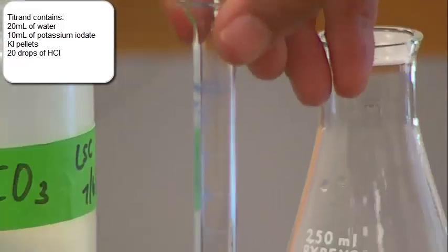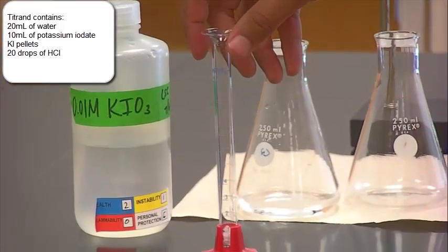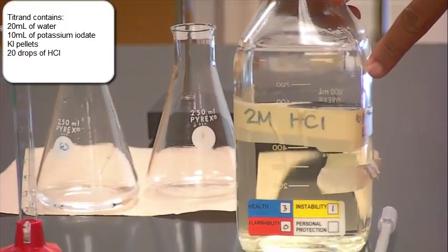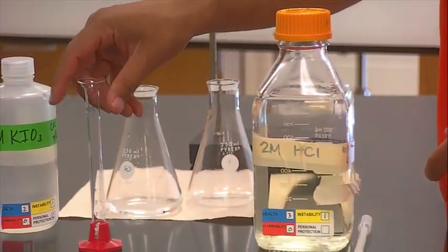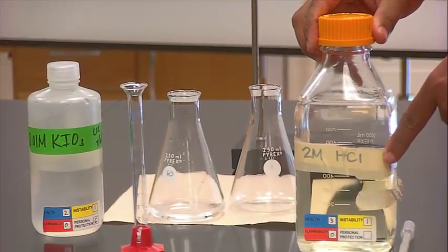The purpose of the potassium iodide pellets is to generate I2, molecular iodine, in conjunction with 20 drops of HCl. The I2 is generated by the reaction of the potassium iodide pellets with potassium iodate in acidic media.